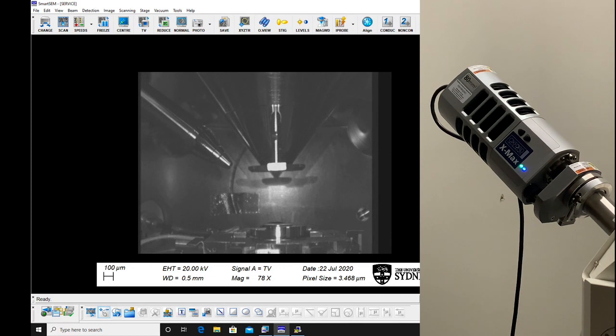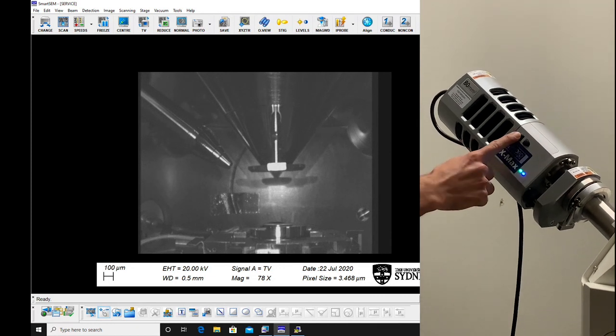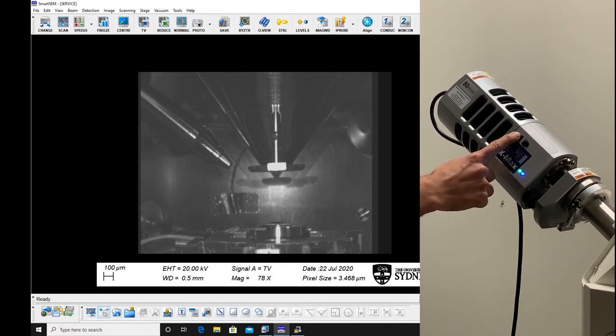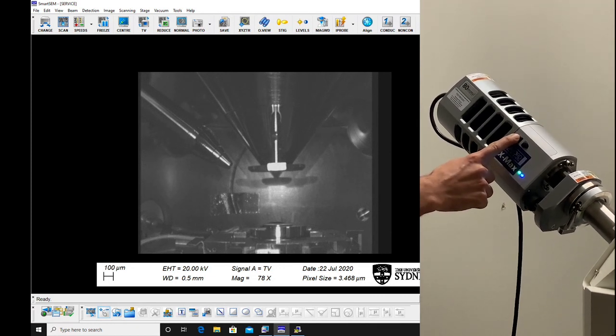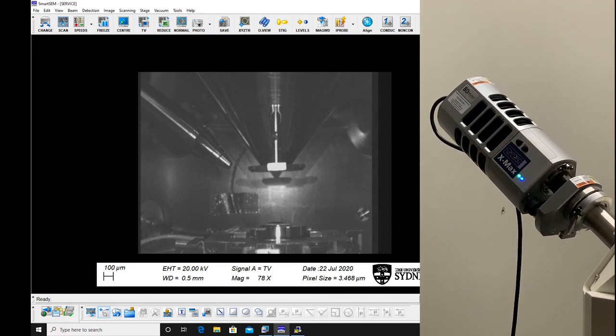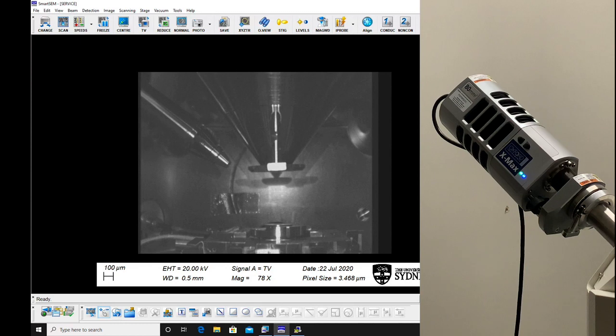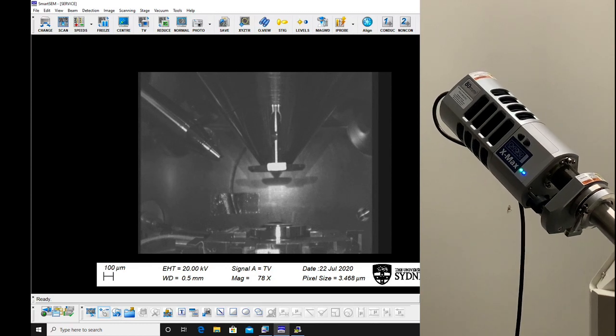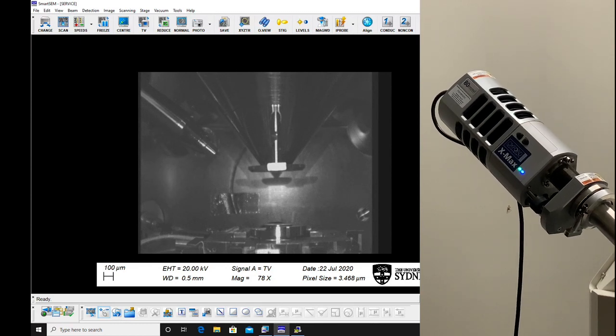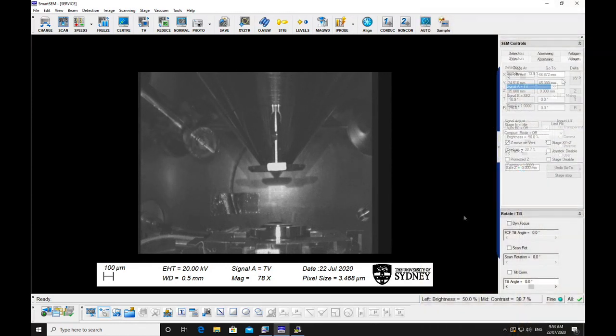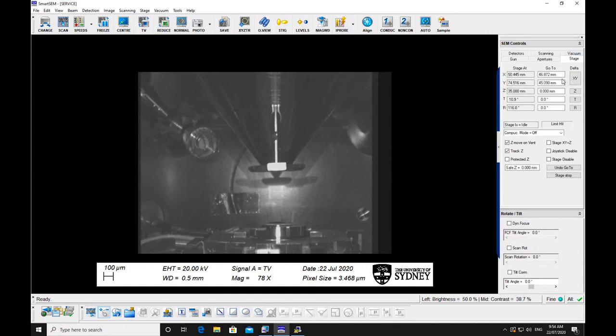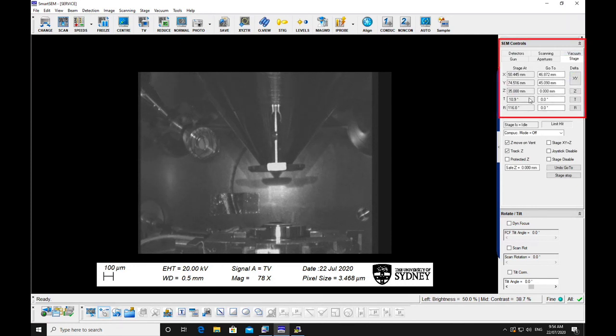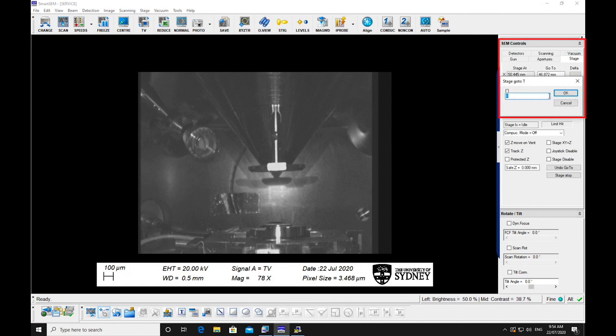Withdraw EDS detectors if needed by pressing the top button on the detector. Check that the specimen stage is not in a position to collide with anything on opening the chamber. Return stage to tilt 0 degrees via the stage tab on the SEM control window.